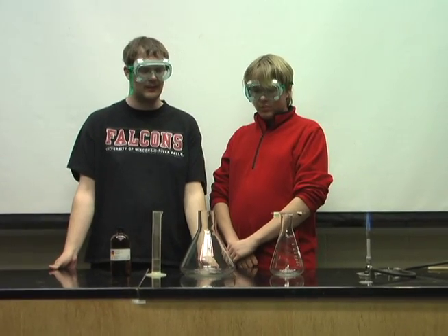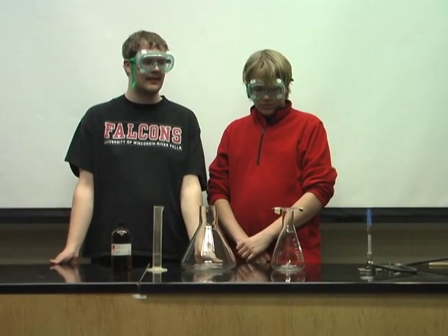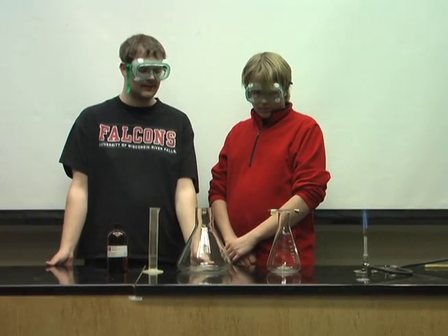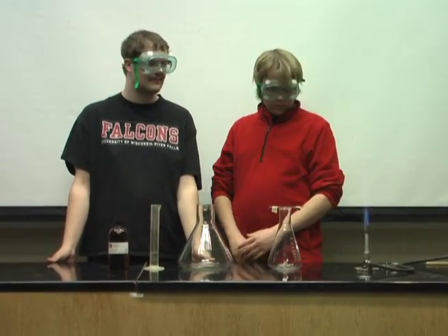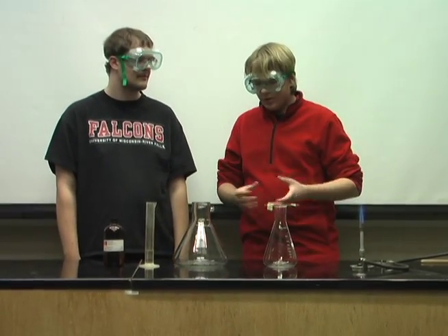Today we shall be doing the methanol bush experiment. First off, 38 milliliters of methanol is added to the flask — this has already been done. Now we're going to heat up the platinum catalyst to start the reaction.